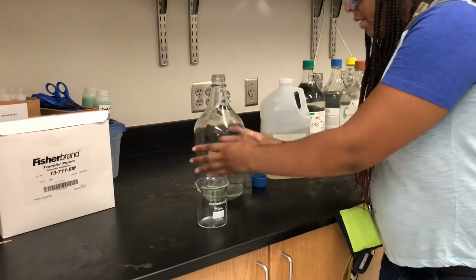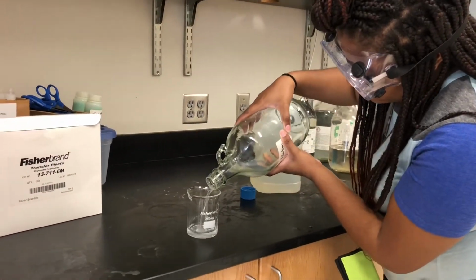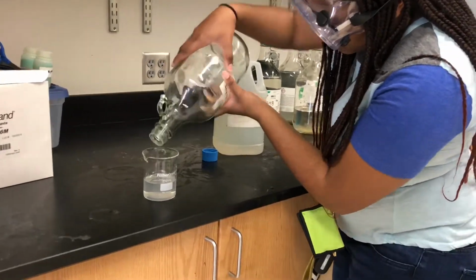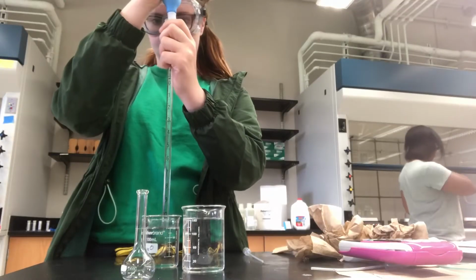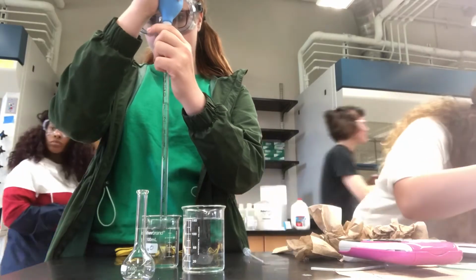The test solution is collected from the stock bottle. You should never pipette directly from the stock bottle. The stock solution is the concentrated solution which will be diluted, in this case a 20% sugar solution. The stock solution is transferred using the glass pipette to the volumetric flask.